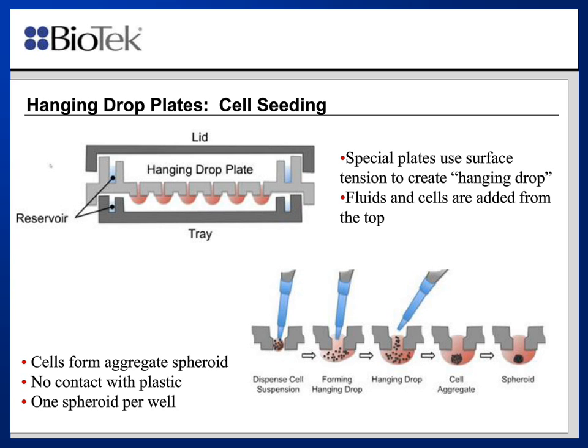For cell dispensing, the peristaltic pumps, as mentioned before, were used to add cells of appropriate density to the entire plate, and then automated imaging was performed to track spheroid formation over the course of several days or weeks, depending on the cell types used for the spheroid formation.